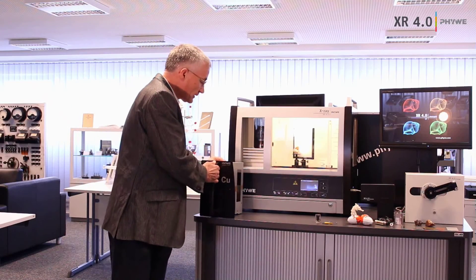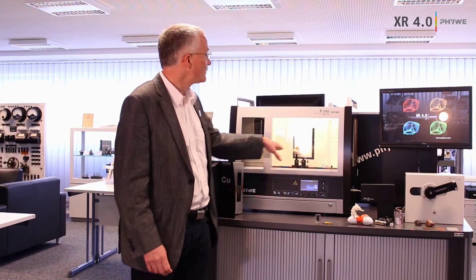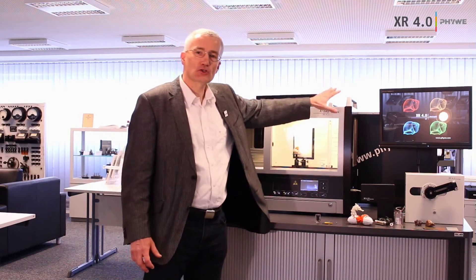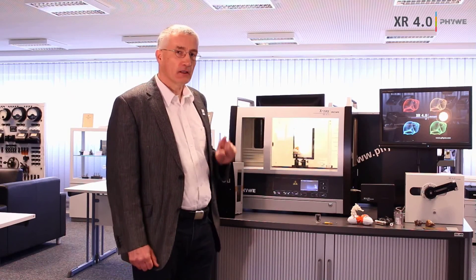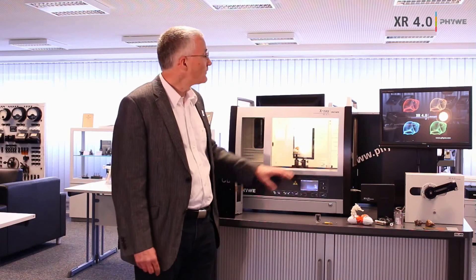Another highlight is a large experimentation chamber. Inside the experimentation chamber there's an optical bench so that you can conveniently replace one setup with another. We also have three large windows so that you can see inside from three different sides. All windows are safety windows with special protection against radiation, and there's also a lock mechanism built into the door.